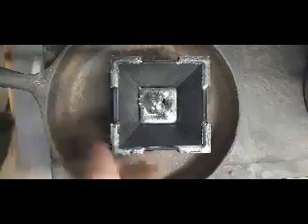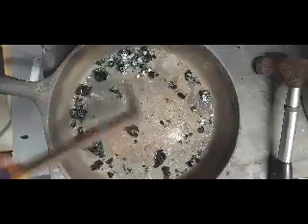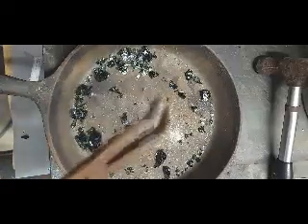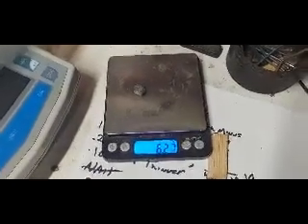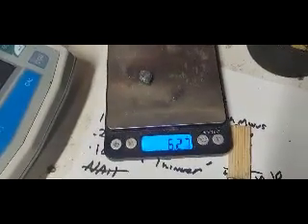I think we're safe now. Real nice lead button — that's a real good recovery. Perfect. First weigh-in, we lost a little bit of lead, but that is acceptable, going from seven grams down to that.